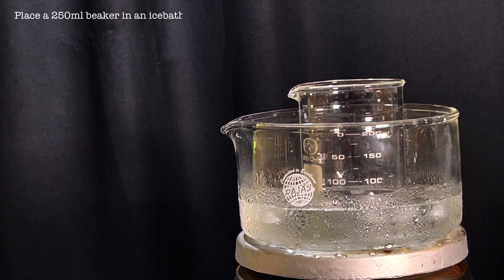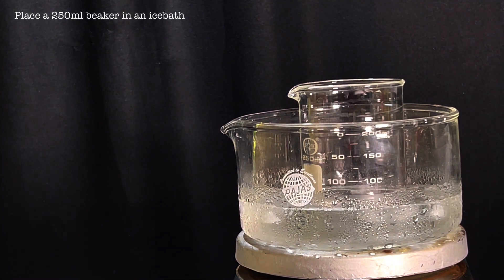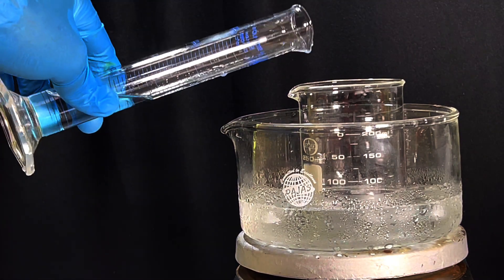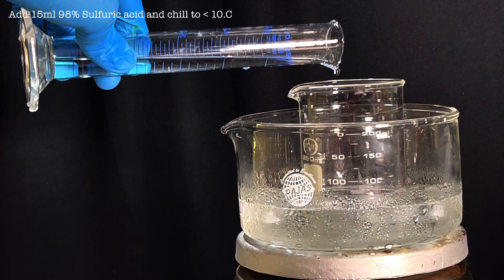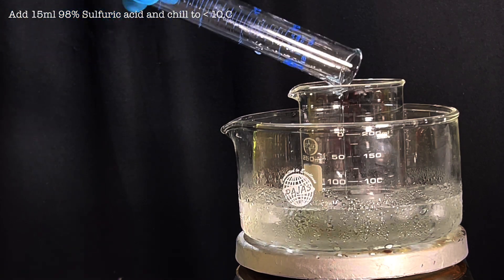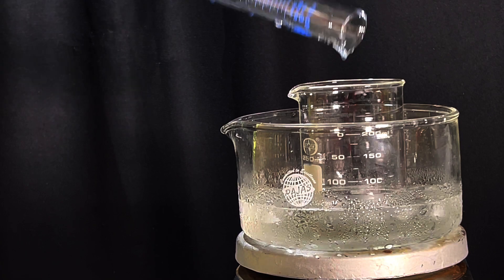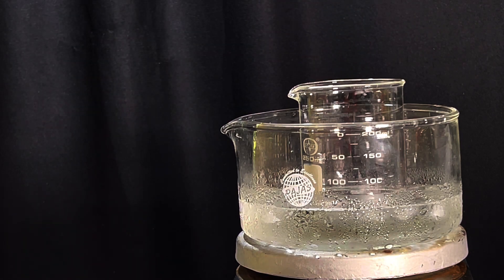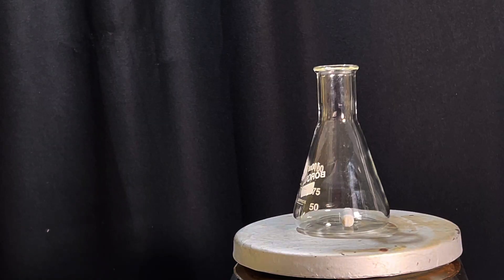Start by placing a 250 ml beaker in an ice bath. Add 15 ml of concentrated 98% sulfuric acid to the beaker. Keep the beaker in the ice bath and chill the acid to below 10 degrees C.